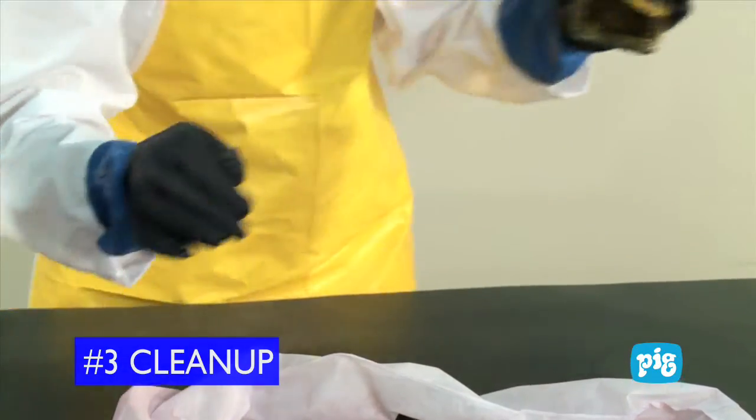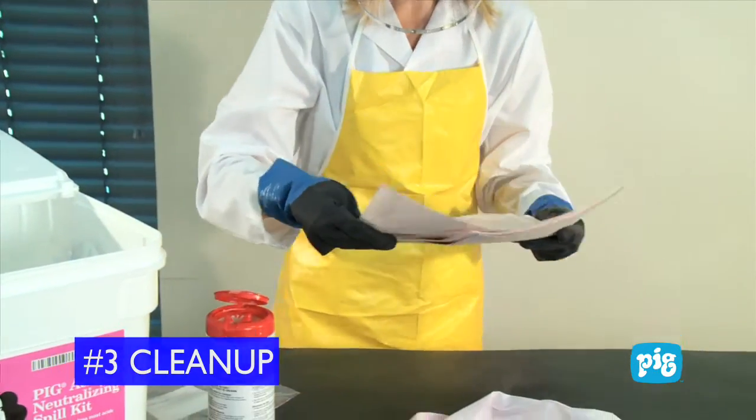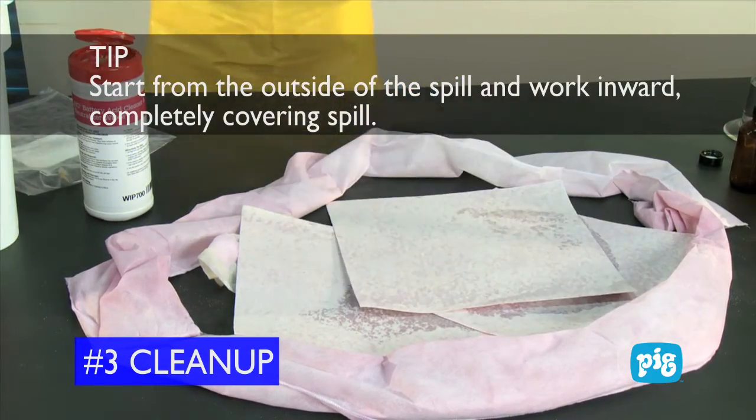Step 3: Clean up the spill. For smaller volume spills, use absorbent mats to absorb the spilled liquid. Another tip: start from the outside of the spill and work inward, completely covering the spill.